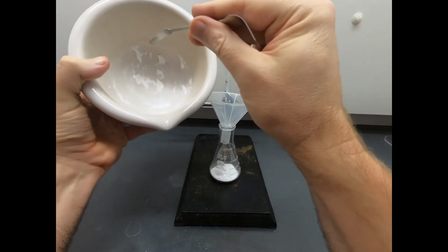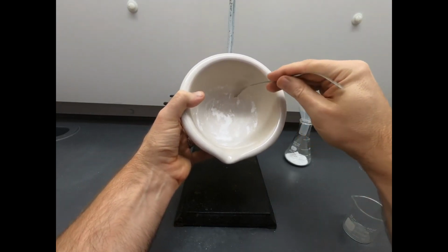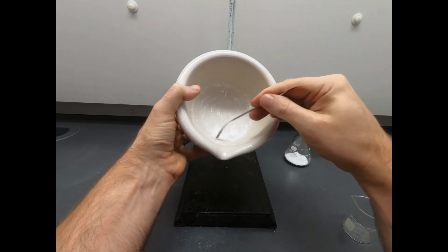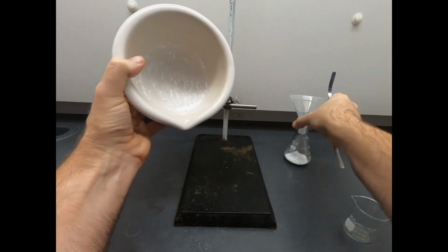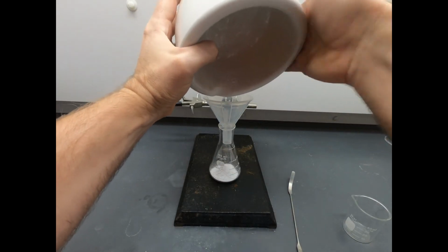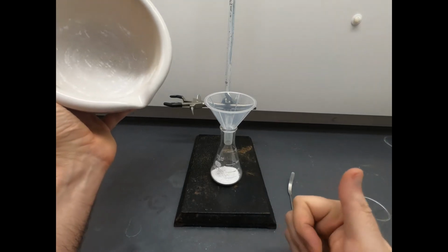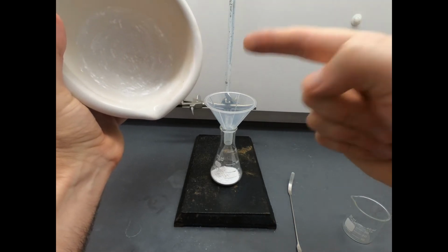And now I'll use this micro spatula to scrape some of this off. And again, our goal is not to get this pristine and clean. We just want to get the vast majority of this solid out of here. Okay, that's better. Now the old tap, tap, tap, tap, tap. We lost a little bit there, but not too bad. Okay, wonderful. So we still have this solid here, and I definitely want that solid. It doesn't represent a large percentage of our mass, but it still does represent some.